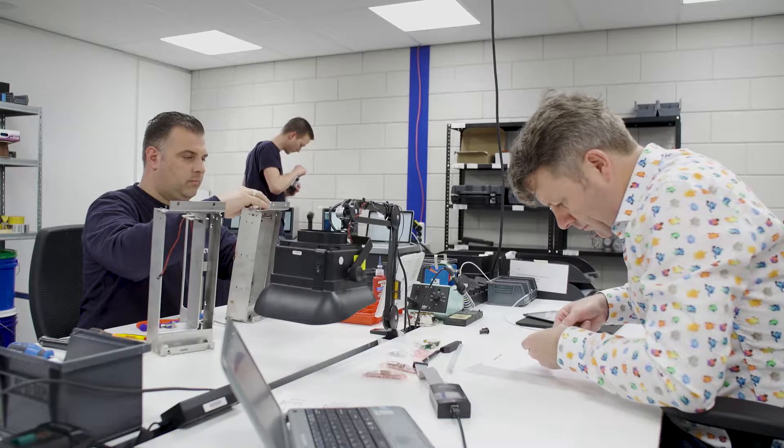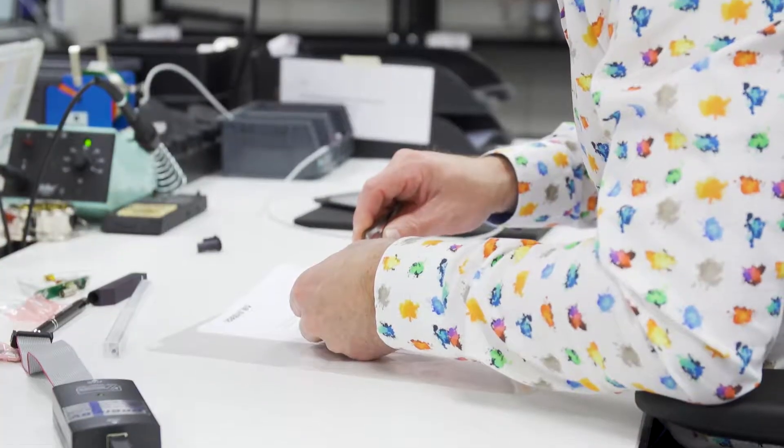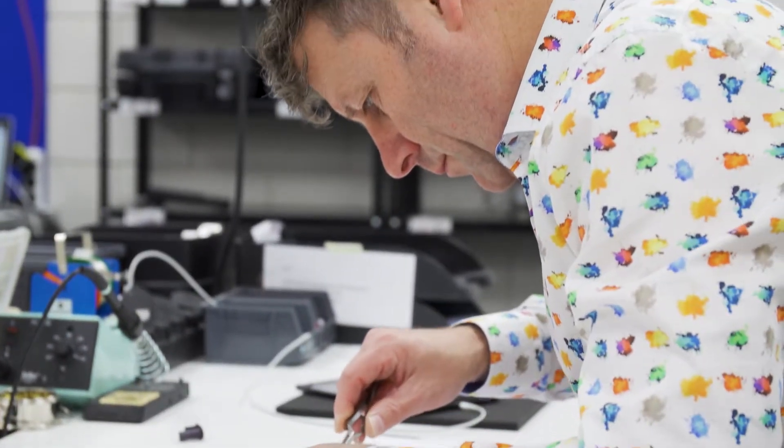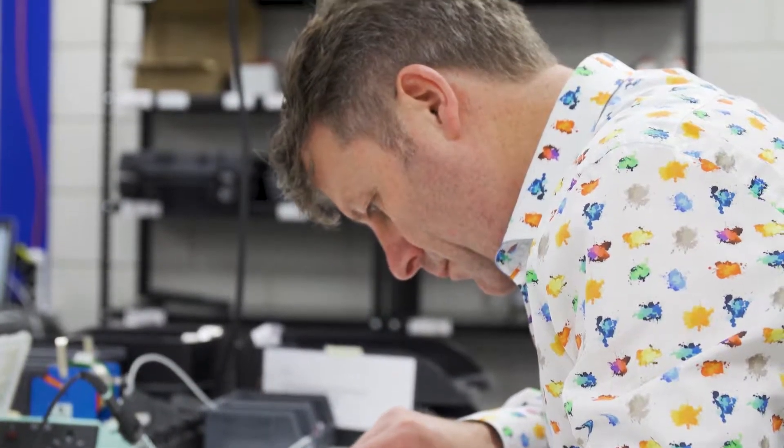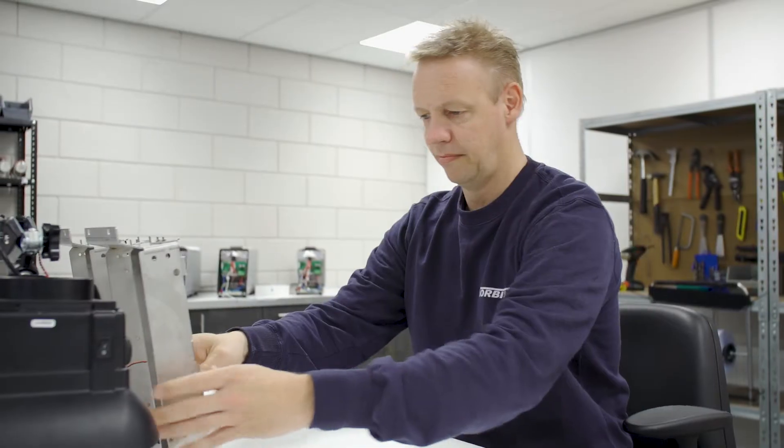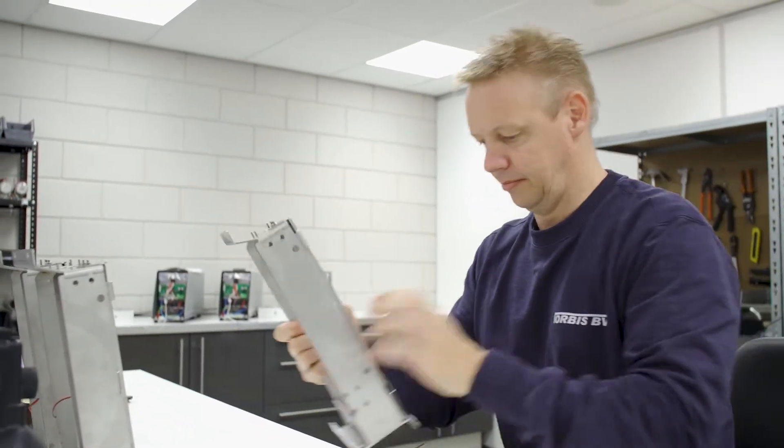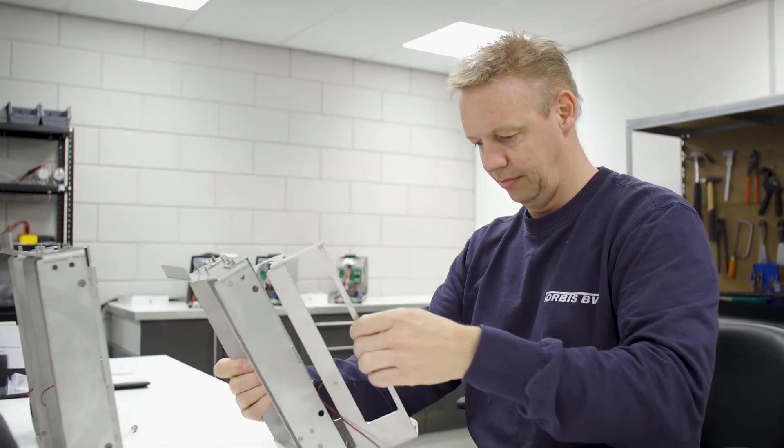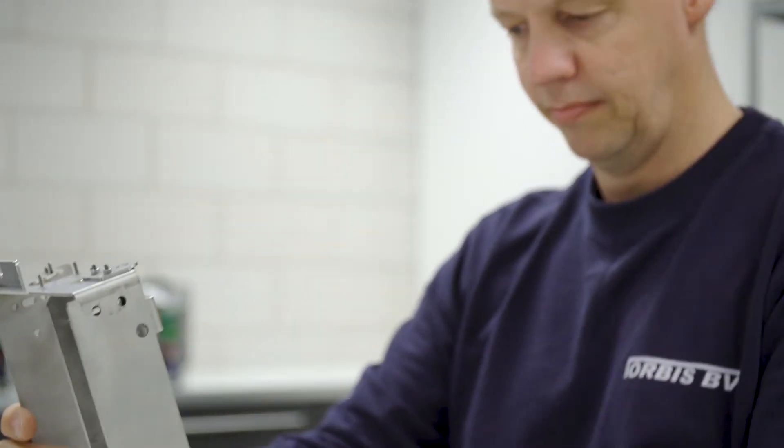Orbis BV is a company producing test equipment for the petroleum industry. We manufacture analytical equipment and try to use our experience to make instruments that give more insight into the test parameters and this way make a difference.